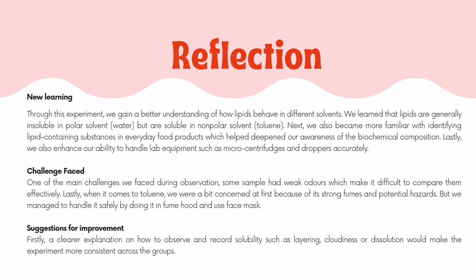One of the main challenges we faced is during observation. Some samples had weak odors, which made it difficult to compare them effectively. Lastly, when it comes to toluene, we were a bit concerned at first because of its strong fumes and potential hazards, but we managed to handle it safely by working in a fume hood and using face masks.